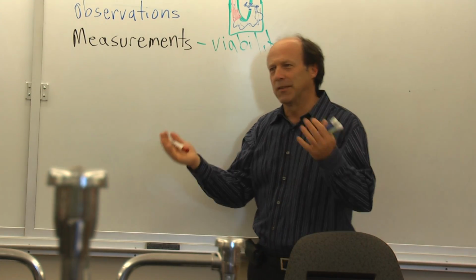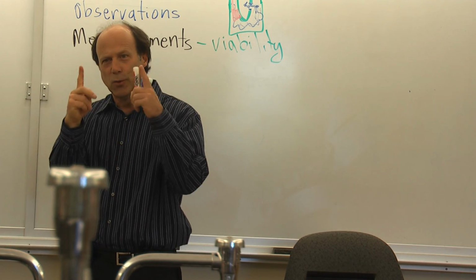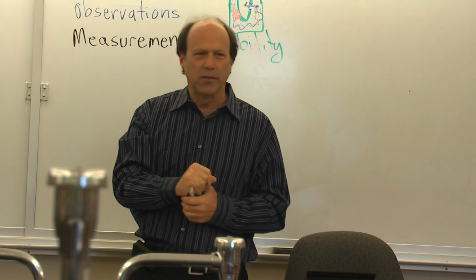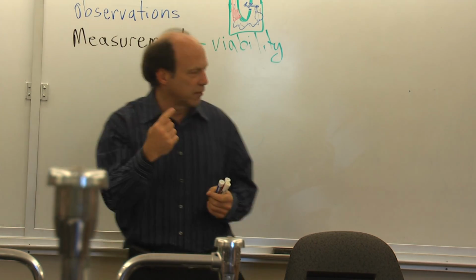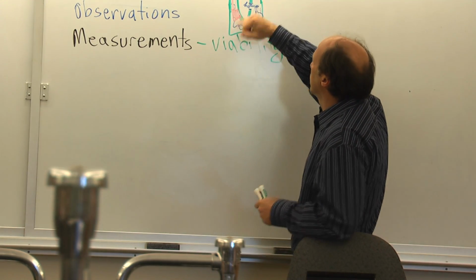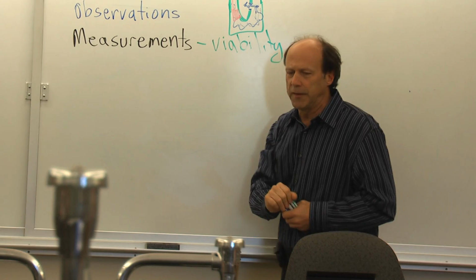You're used to this basic understanding of electricity. When you plug in anything at home, it's got two wires, right? One is the hot one, and one is the ground. The current is flowing. So there's a flow of current, and the cell is an insulator. When it goes through the pinhole, you see that deflection.